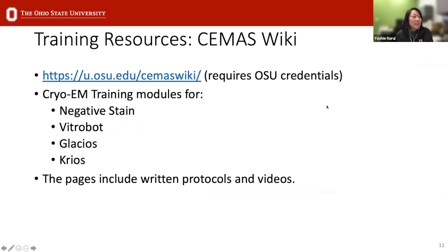Everything that we do here, which includes negative staining, preparing cryo-EM grids, and then screening them, we have training resources for on our wiki, which I don't know if we've advertised as well as we should have, but the link is right here at this u.osu address. You do need OSU credentials, but we have uploaded both written protocols and training videos that show you step-by-step how to do everything you really need for single particle analysis.